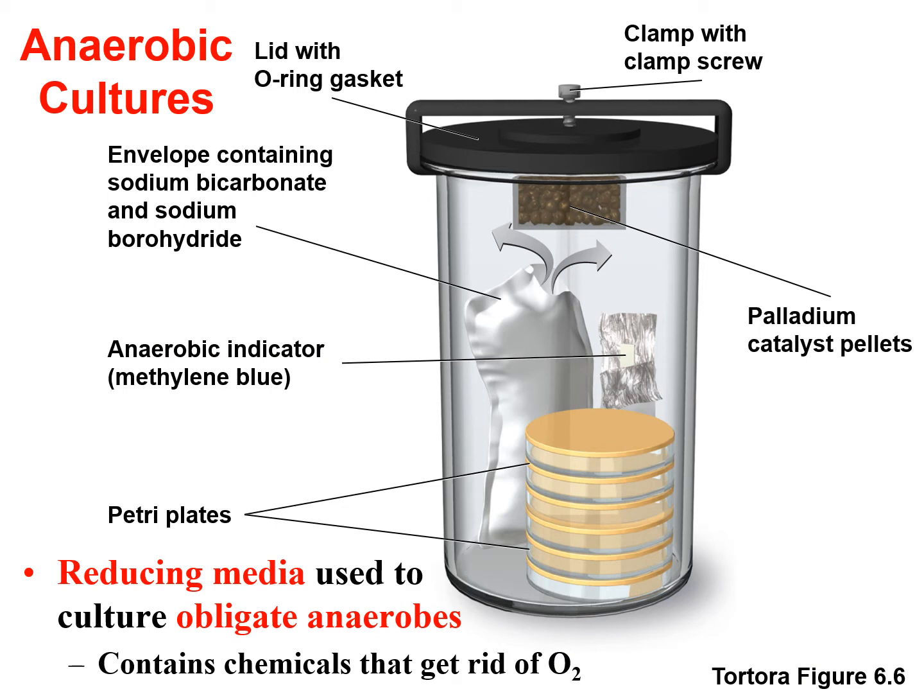Okay, so reducing culture media. This is really important to remember. This is going to be used for anaerobic cultures. So if you're trying to culture obligate anaerobes, remember that obligate anaerobes are killed by oxygen. So you can't have any oxygen around because that's going to kill them. The reducing media actually has chemicals in it that are going to bind to any oxygen around and take it out, so it's not going to be there to kill the microorganism.